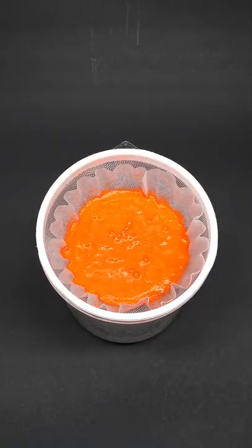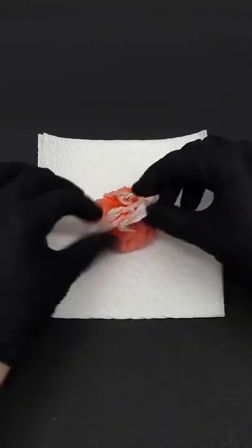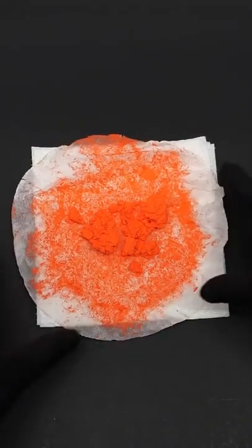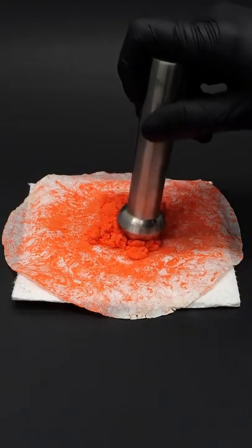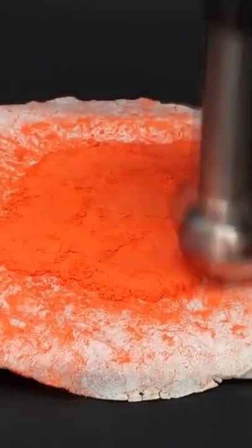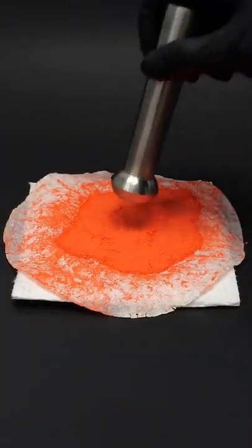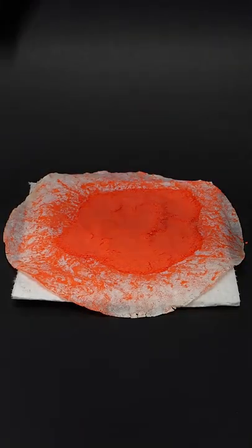extra water. I let it sit here for about a day to dry, and then I spread it out on some paper towel. A few days later, it looked nice and crispy, and I was able to crush it into a powder. Now, I finally had some dry mercury iodide, and it's time for the magical part.